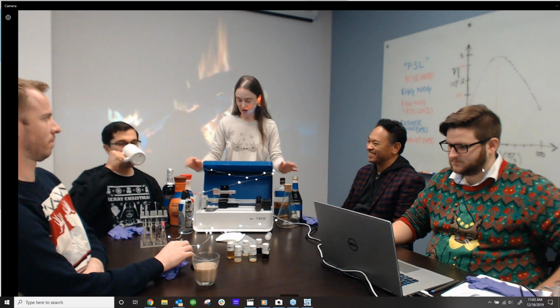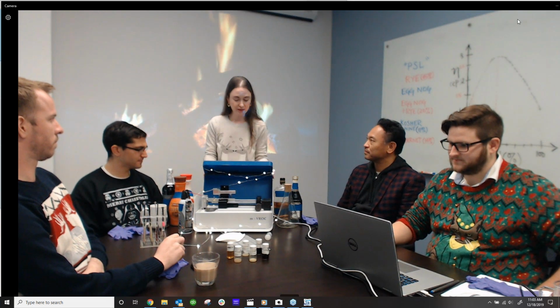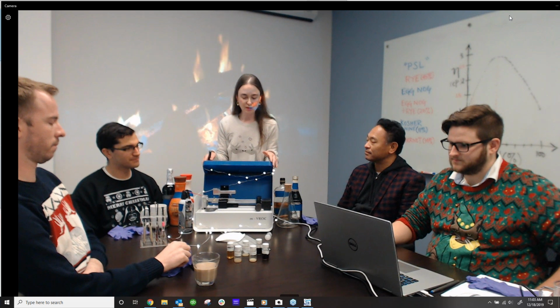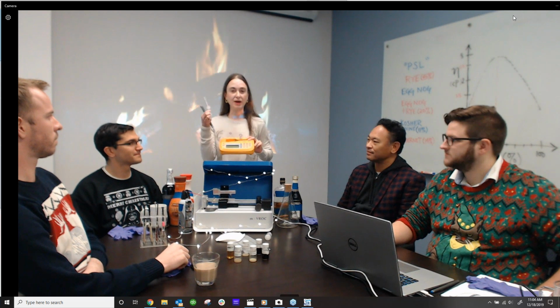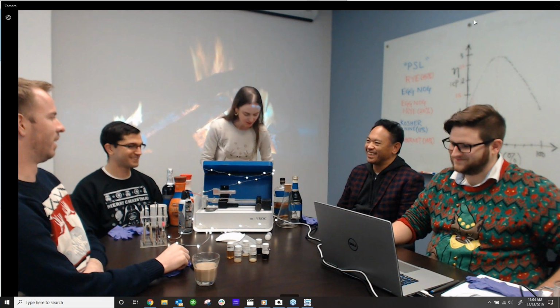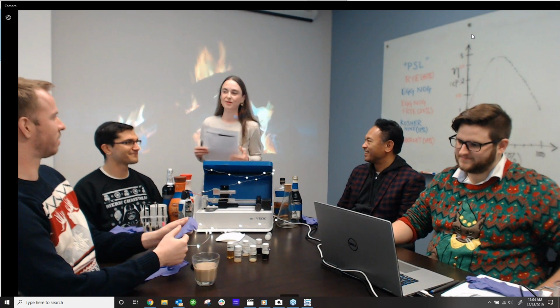So we're going to get into it, and just a quick other tip. This is more of our lab research level instrument. However, we do have a portable instrument with a rechargeable battery and disposable pipettes. So if you need to test on the go, if you don't trust your friends, you can take this with you and test, again, very small volumes while you're out and about.